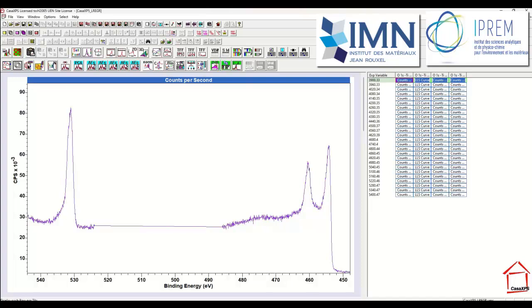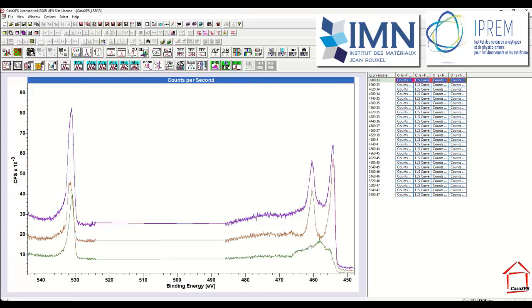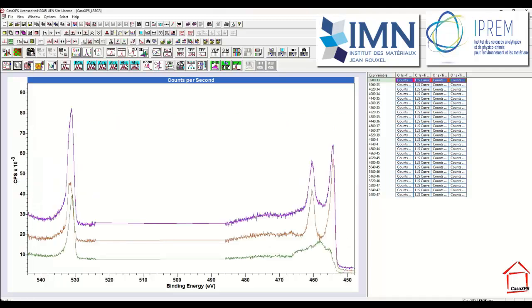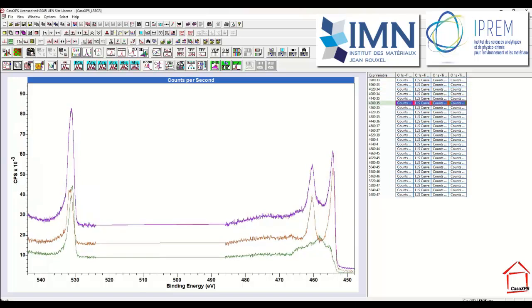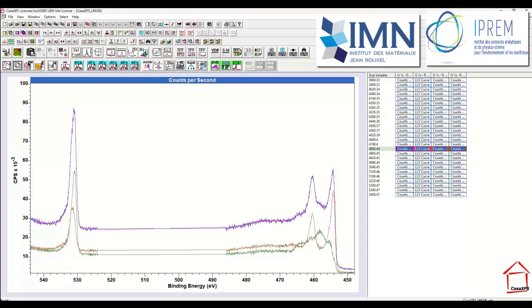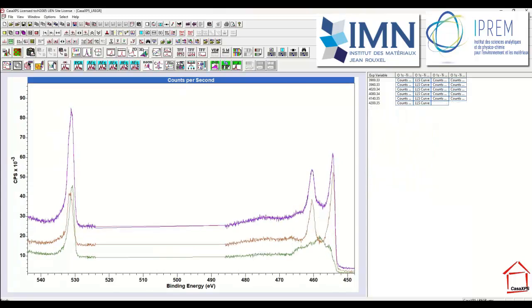So when I display these overlaid, you can now see that the data, it's probably easier to see if I zoom in, that red trace is the least square solution and the blue trace is the original data, and these are the two component spectra in the correct proportions to produce this red trace. So let's have a look at this again in more detail, and we will then use the arrow key to step down the selection, and we can observe how the data change over that interval of the profile, rather the oxidation sequence.